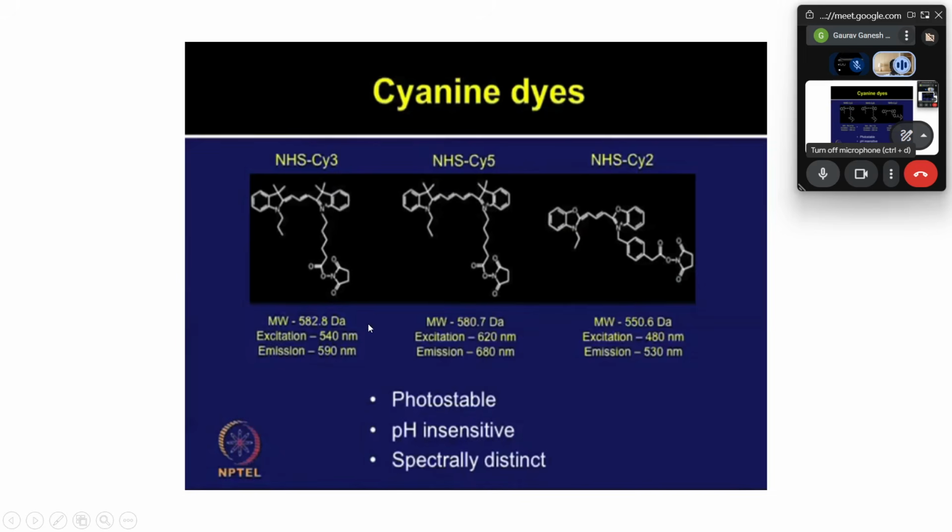So, the major benefit of these dyes is they can be visualized in a different wavelength. They can be emitted, given their fluorescence ability, by giving certain excitation and emission wavelengths. Their excitation is at a different wavelength, because of which we can visualize all three samples. For example, you have three samples, and you use one dye for one sample, one dye for another sample, and another dye for the third sample.